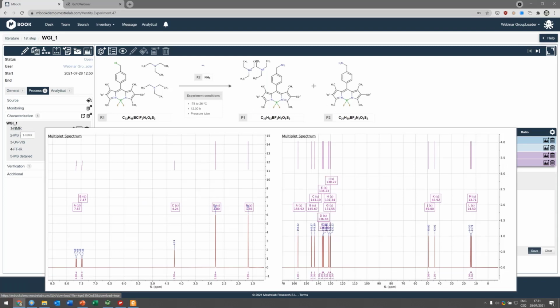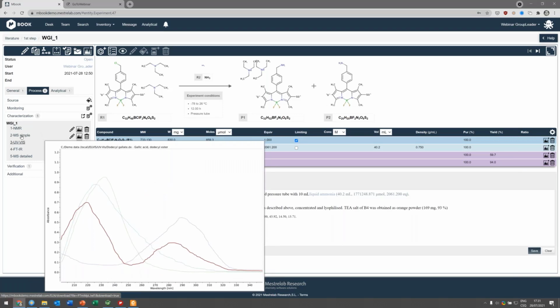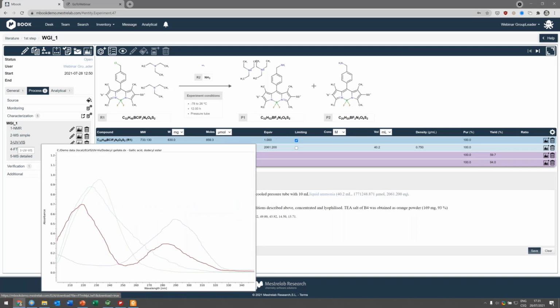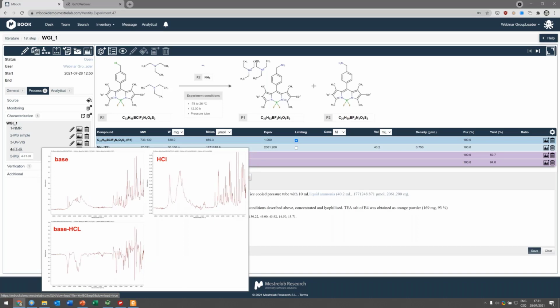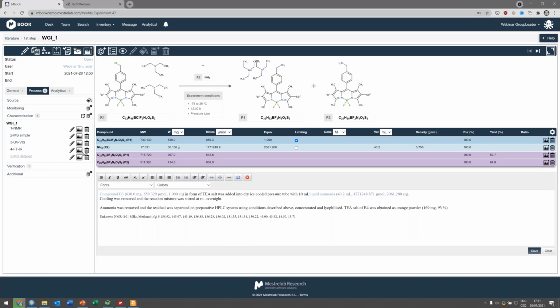Now, the data supported are NMR, of course, but also LCMS, GCMS, and any other combination of liquid chromatography or ion chromatography. But currently, everything which can be processed in MNOVA, which is running in the background, so it can process data also from UV vis, infrared, Raman, and all the spectroscopies having the same data format, which is XY axis, basically. And also you can upload multiple pages, and if you click on it, you can download the data file.